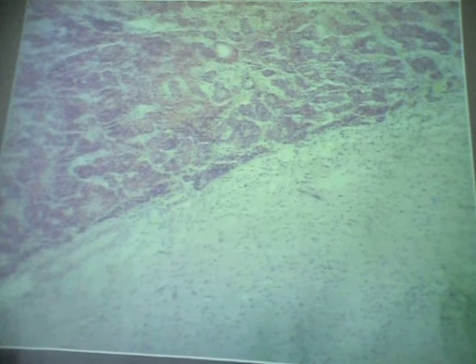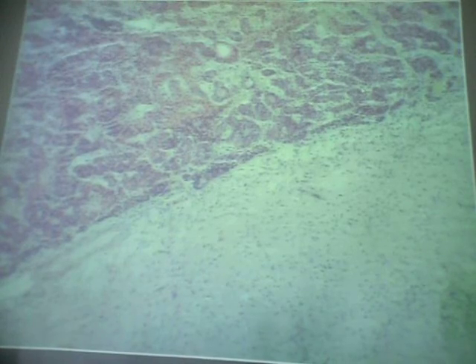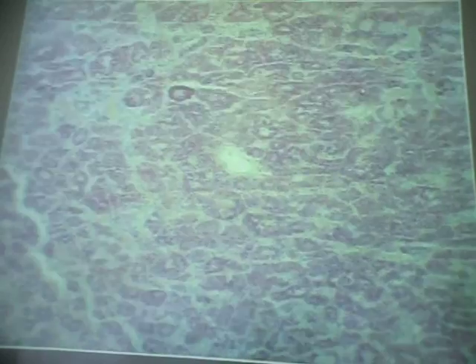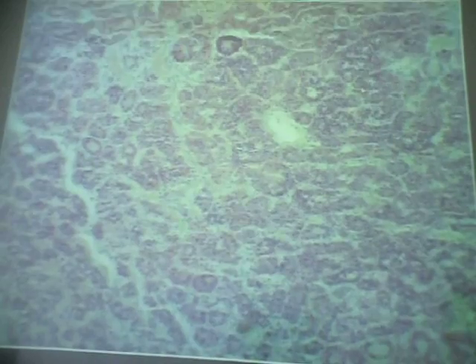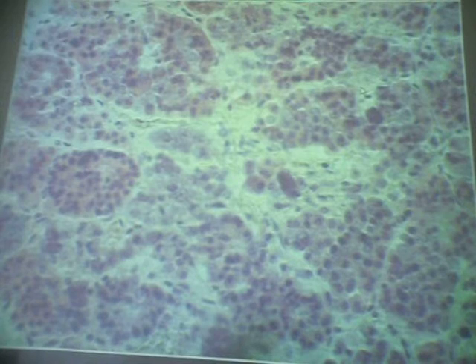Okay, the other part of the pituitary I want you to know is the anterior pituitary. As I said, this is glandular. We have cells here that actually produce the hormones and release them into the blood. So again, this is called the adenohypophysis. Now there are two major cell types here, which I'd like you to be able to identify. And you can distinguish them based on the color or the stain on their cytoplasm. Not the nucleus, but the cytoplasm.